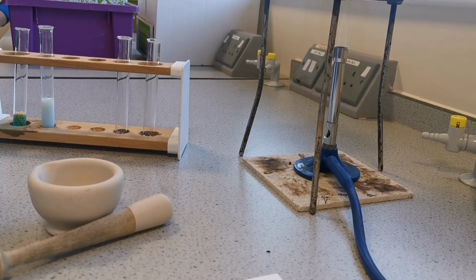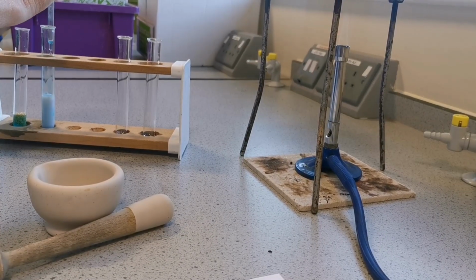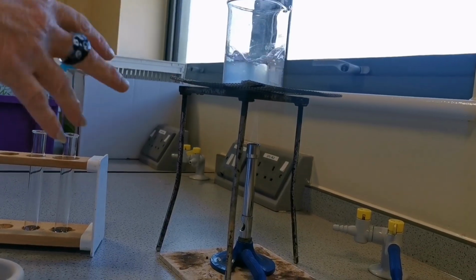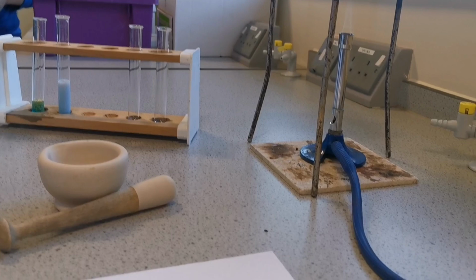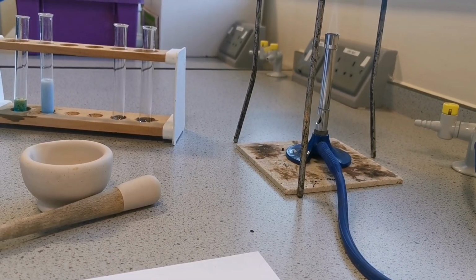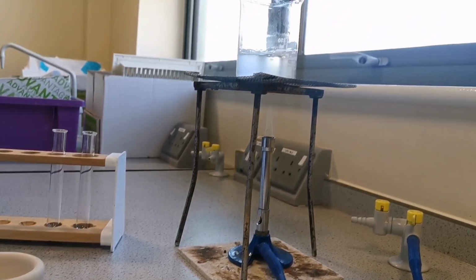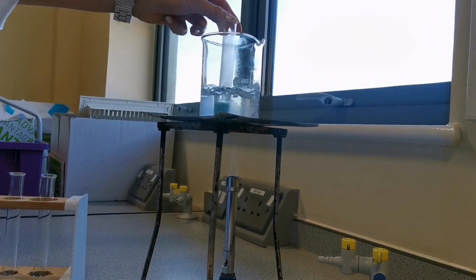You will probably notice that to my side is a water bath. Technically, this is a beaker with boiling water in it. We've been heating this up for about 5 minutes, and now it's ready to go, because this is the only food test that actually requires heat as well. So we are now going to add these 2 test tubes. We've got a biscuit here with some Benedict's in. We are going to carefully add this to our water bath.